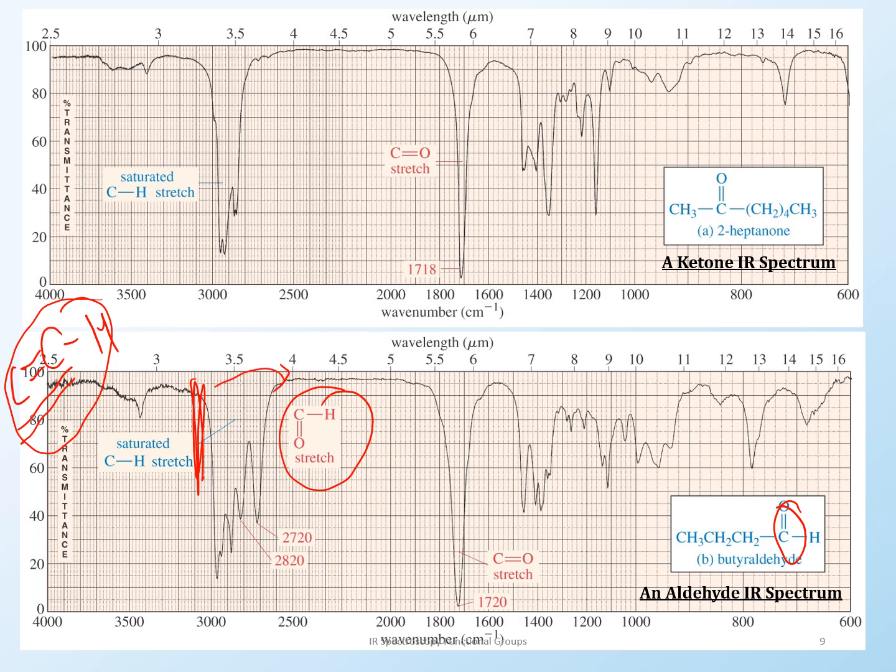I don't know if that helps you. I hope it helps you, okay? But it is supposed to help you. So alkene peaks come on the left side of those CH stretches, and then the aldehyde peaks come on the right-hand side, okay? So those are the things you're looking for when you're looking for an aldehyde. Now, for an aldehyde, you have to look at the CH peak, because if you're not looking at this, it means you have not really identified your aldehyde. So make sure you're looking at this as well as the carbonyl peak. There are two peaks involved here.